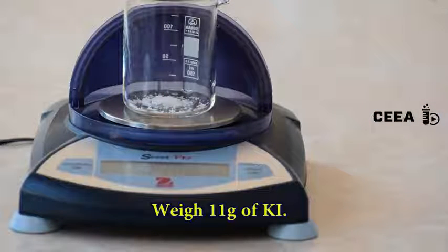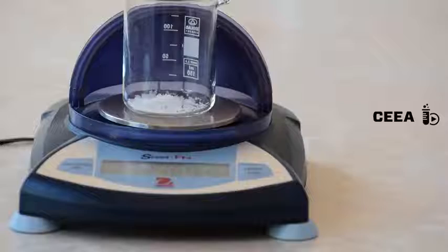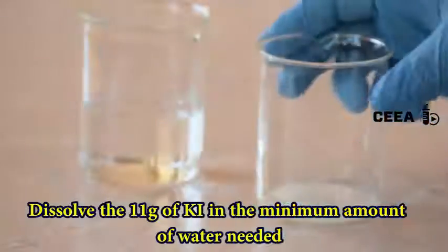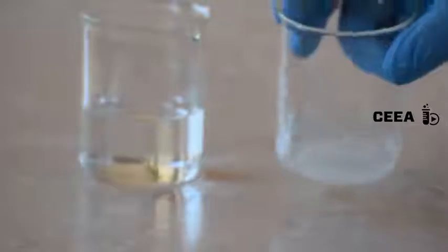Weigh 11 grams of potassium iodide. Dissolve it in the minimum of water needed. As it is very soluble, we don't need too much water.